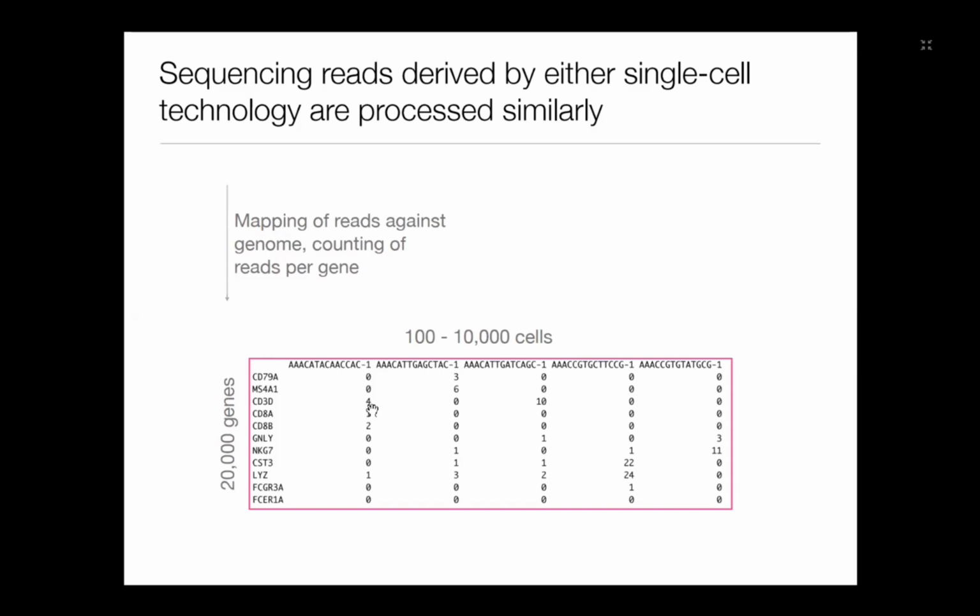This is important to understand what the gene counts table means, because it's actually the basis for everything that follows. Do you see anything which is, let's say, special in this table? Because actually it's different from bulk data. Just look at the numbers and see, do you think something is weird?